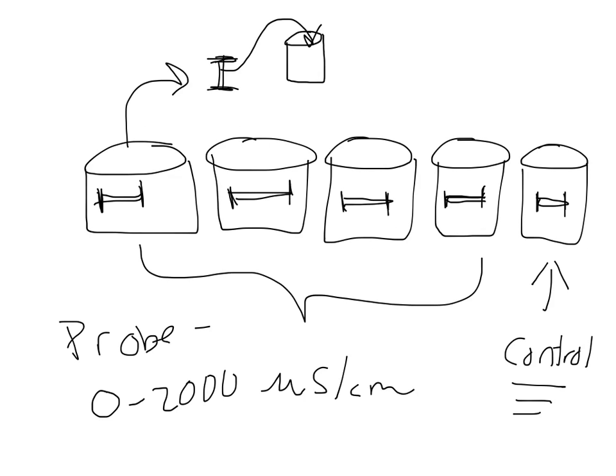So on your actual probe, you have your LabQuest. I'm going to give you guys a quick little demo on how to use the LabQuest.